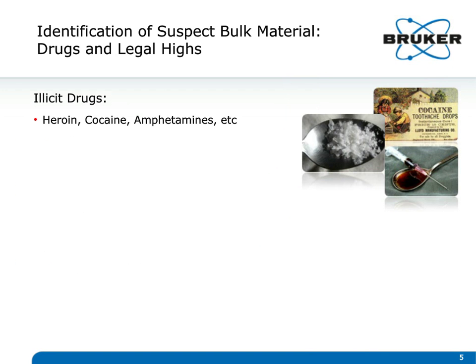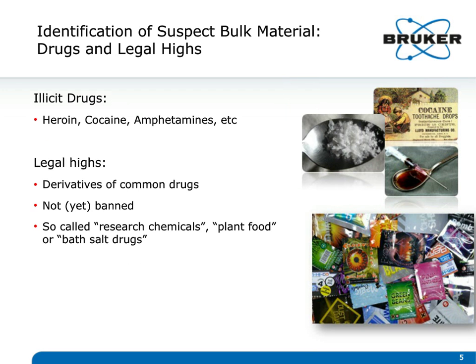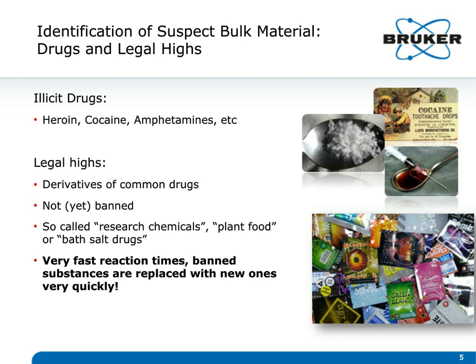So when you look in the bulk material, and I'll separate these examples from looking at the bulk materials to looking at microscopic samples. In this case, again, we're looking at heroin, cocaine, amphetamines, and of real interest in today's world are legal highs. So people going to nightclubs and not remembering what happened and when and so forth, and being able to react to new drugs, the new fashion of drugs that are being used for people to get high, it's a really dynamic and fast-moving area of science, and one where spectroscopy can really be most useful.